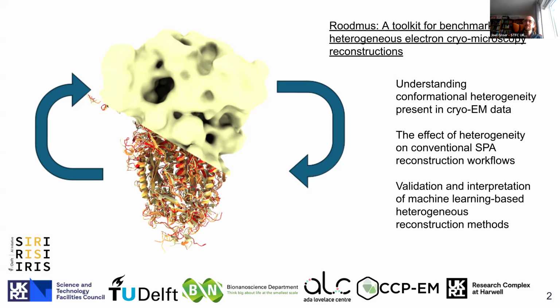Okay, so what are we interested in? We're interested in developing tools and performing studies which contribute towards allowing the structural biology community a better understanding of the conformational heterogeneity present in cryo-EM data.